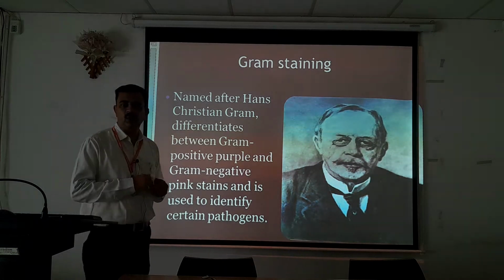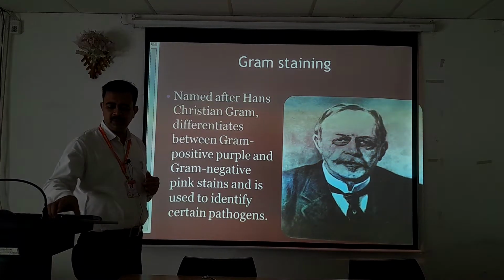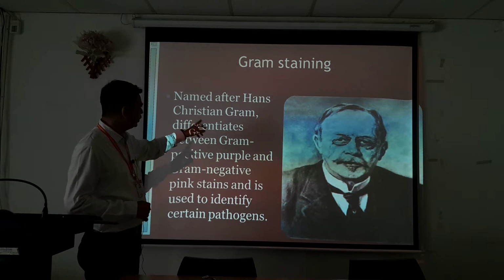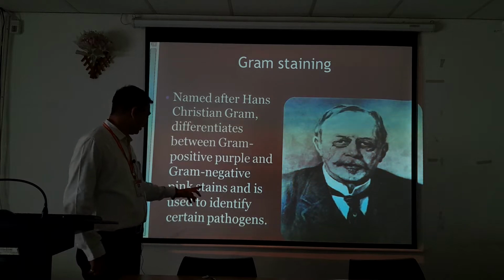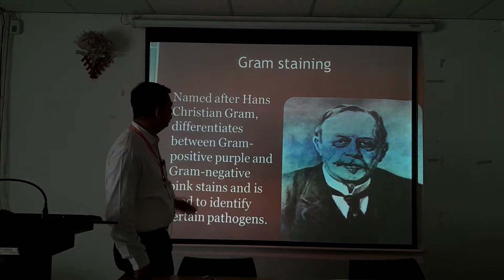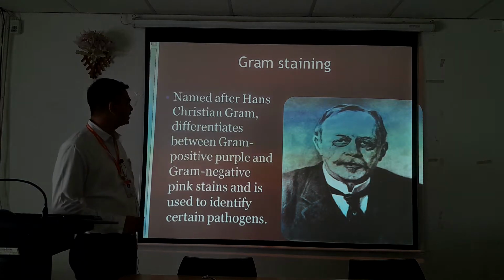Now this technique was developed by a great scientist, Hans Christian Gram, who named the technique after himself. It differentiates between gram positive, which stains purple, and gram negative, which stains pink, and is used to identify certain pathogens. So for this purpose one has to follow this particular method, which was developed by Dr. Hans Christian Gram.